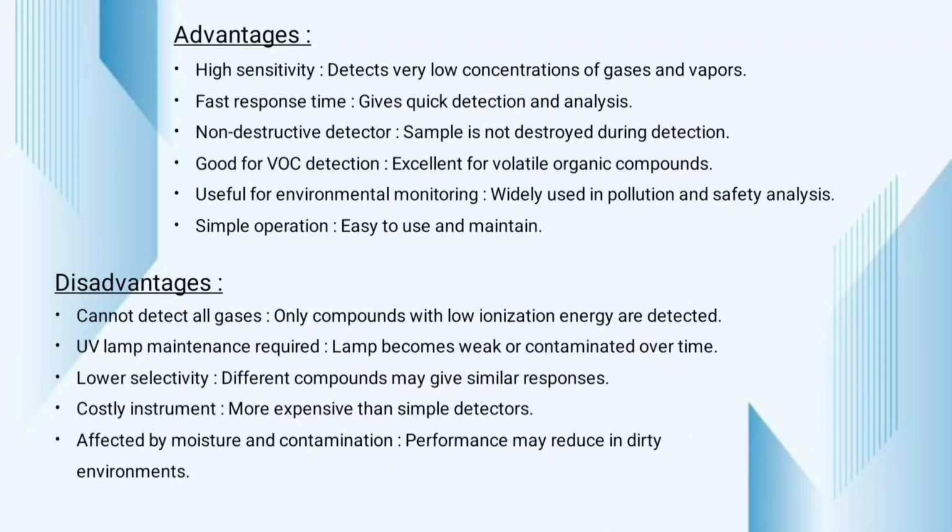Advantages: high sensitivity, detects very low concentrations of gas and vapors, gives quick detection and analysis. Sample is not destroyed during detection. Excellent for volatile organic compounds. Easy to use and maintain.